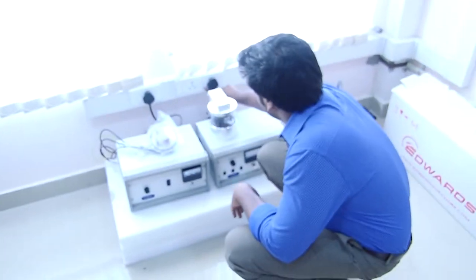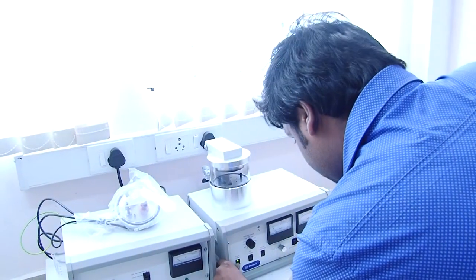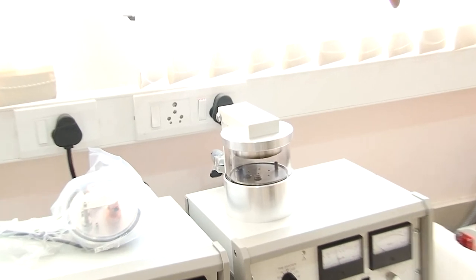This is a sputtering unit. First we have to switch on the vacuum pump. Start the pump. And the purpose of the sputtering is that we are coating a gold palladium alloy.